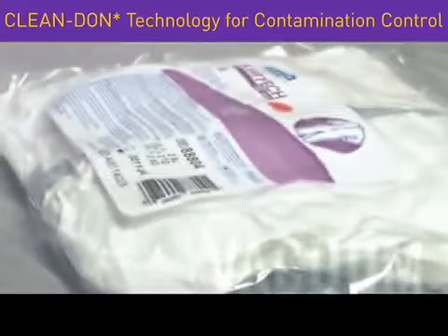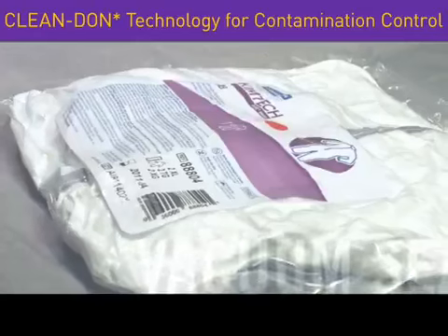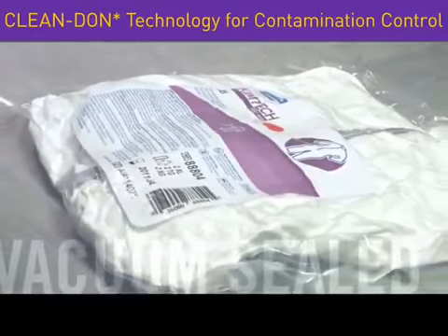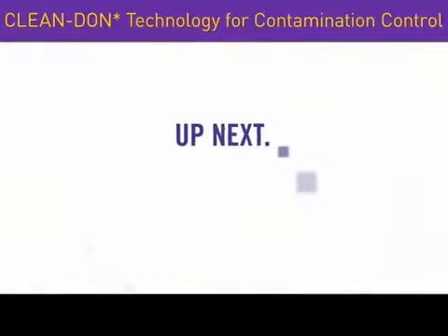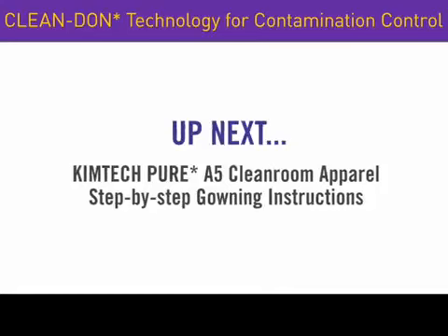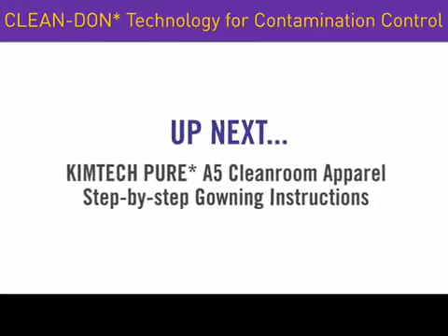Finally, the tightly vacuum-sealed package offers another level of assurance that the product has not been compromised in transport. In the next section, you will see step-by-step instructions on how to don the new KimTech Pure A5 Cleanroom Apparel.